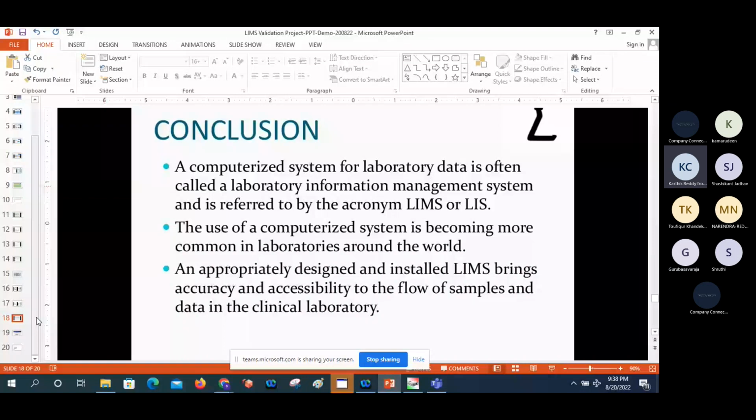Okay. So for example, the table manager has 100 tables. One table you opened and you did something. It will hit somewhere. For example, if you touched the instrument's inner-side SQL coding, it will hit the lot life cycle. That's why 99% of people do not modify whatever is provided by default by the vendor. Generally, as per my experience, I'm giving this answer. Okay, sir.